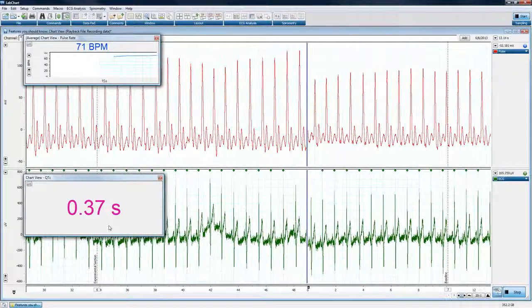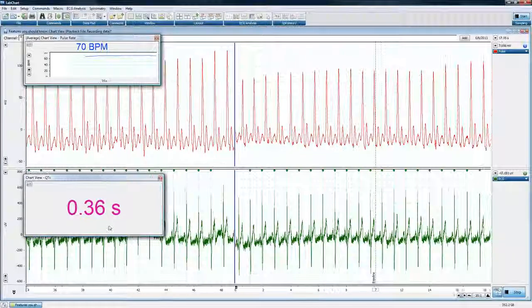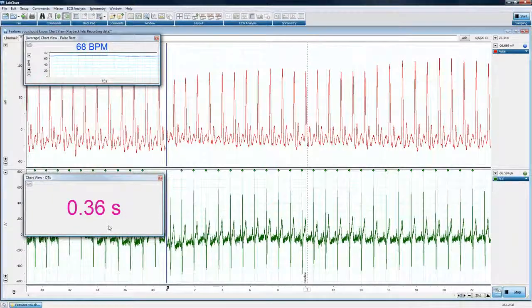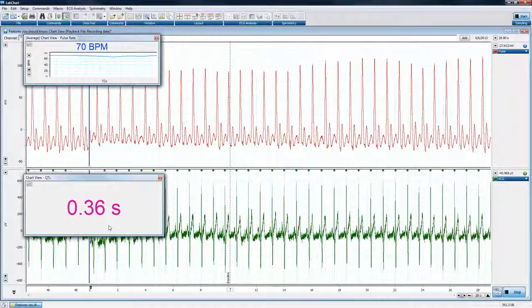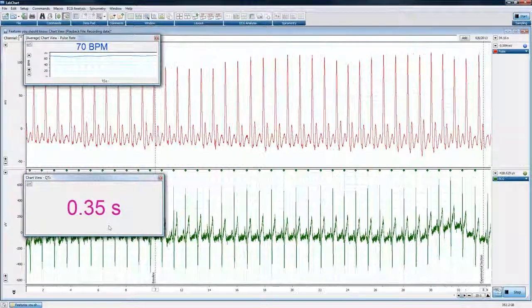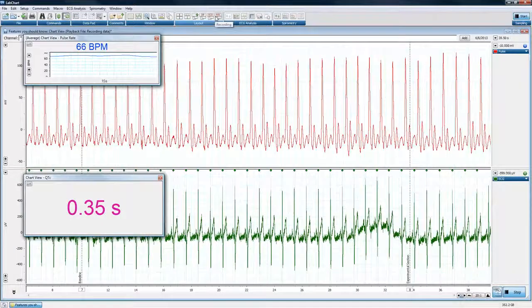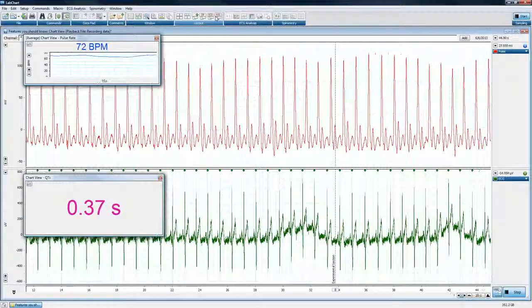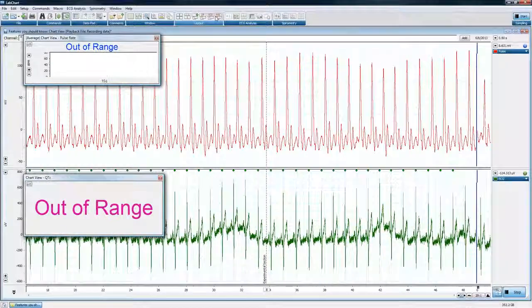Okay, and this is especially great when you have situations where you're recording with, say, 16 channels. If there are only a few channels you need to see at a time, perhaps you can group the channels. We had a customer once that had many electrophysiology channels recording from the heart and also many pressure channels. I think it came up to about 16 channels, and instead of seeing all 16 channels at once, they created 2 layouts, one for the electrophysiology channels and one for simply the pressure channels. This made it much easier to see what was happening at any given time. If you wanted to see the pressure channels, you click the pressure button.